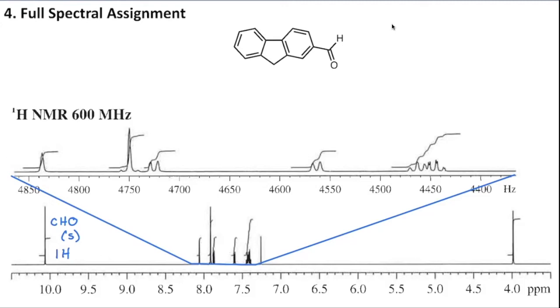So you might say that about the rest of this entire molecule because there's only one heteroatom, oxygen, but the rest of it is aromatic save for one piece, and that is this piece right here. That's the only sp3 carbon that we have. And so those hydrogens are going to be very different from all of the sp2 hybridized aromatic and aldehyde protons that we see. So those almost certainly have to be down here at 4 ppm. And because we know that there are two of them, that'll give us a little bit of information.